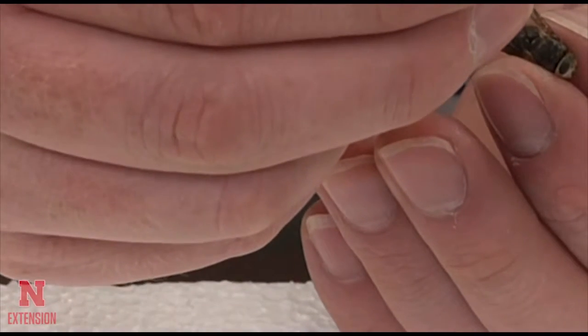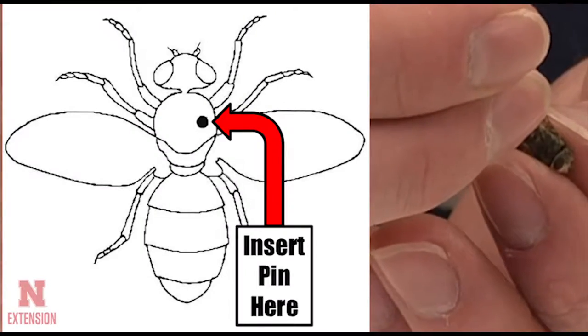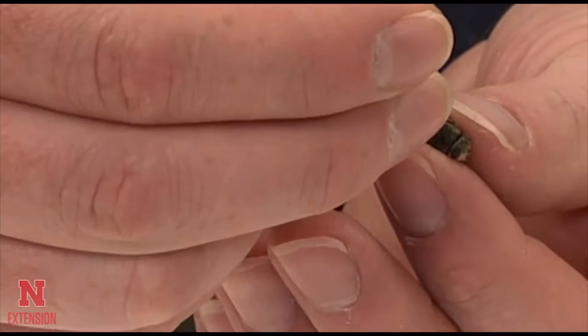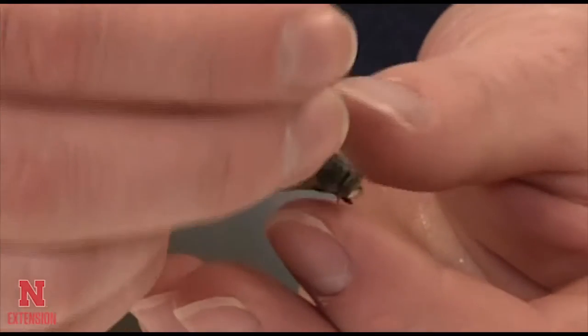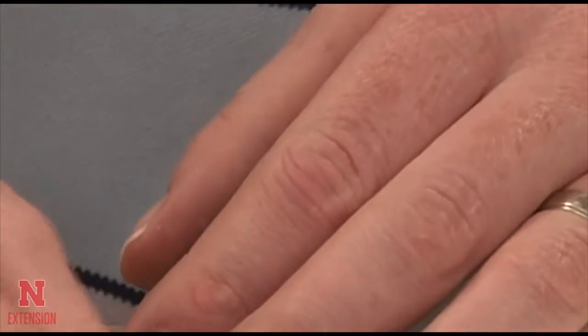Begin by inserting the pin according to the diagram into the thorax of the fly. Once the pin is inserted, make sure that you have the fly level and balanced well on the pin before pushing it all the way through.